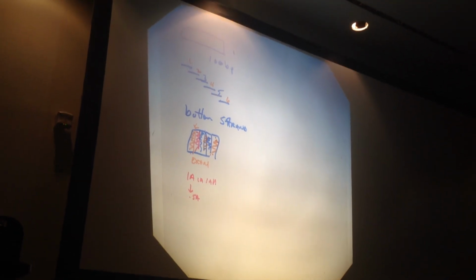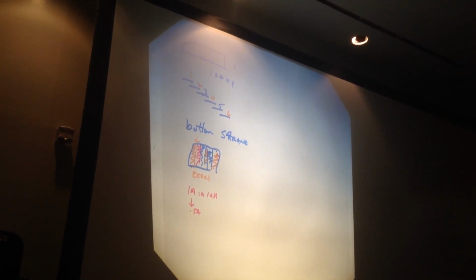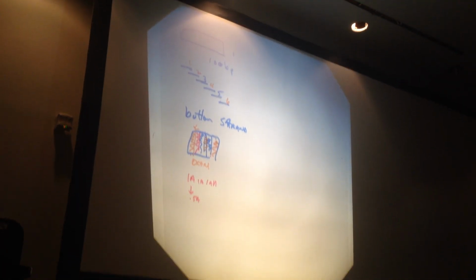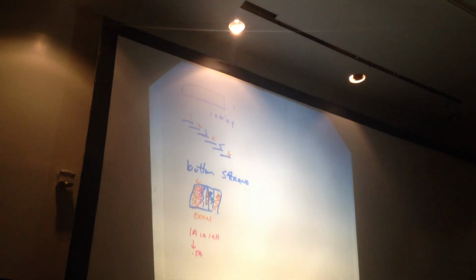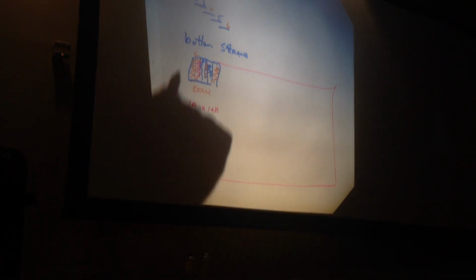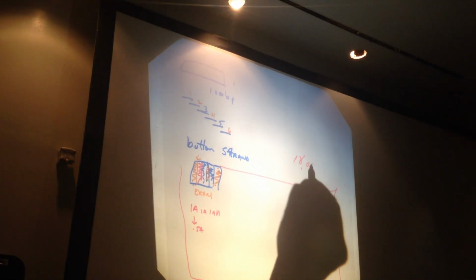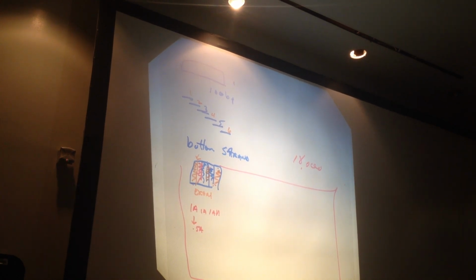So the 6-column thing, what is that? Is that like a gel? No, it's a chip. It's basically an electrical chip of some sort where they can bind oligos to that chip, and they can put a current through the chip. So this is one chamber of a chip, and in fact these chips have 18,000 of these little units in it. Once they put the unit in there with the oligos, do they then bathe it again in RNA? That's right. You bathe it in RNA.